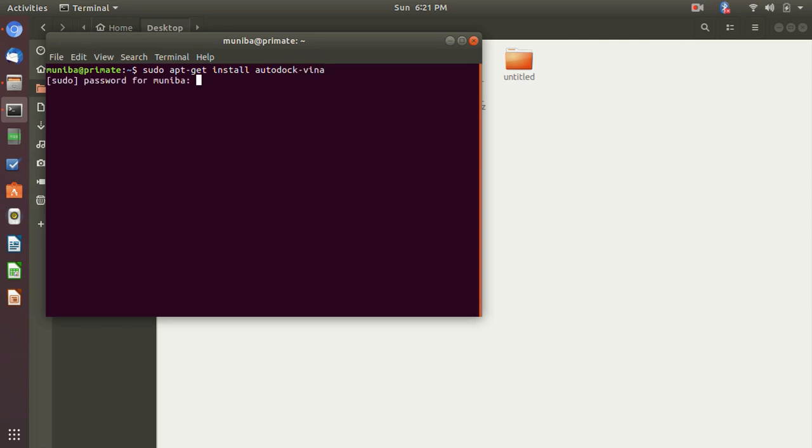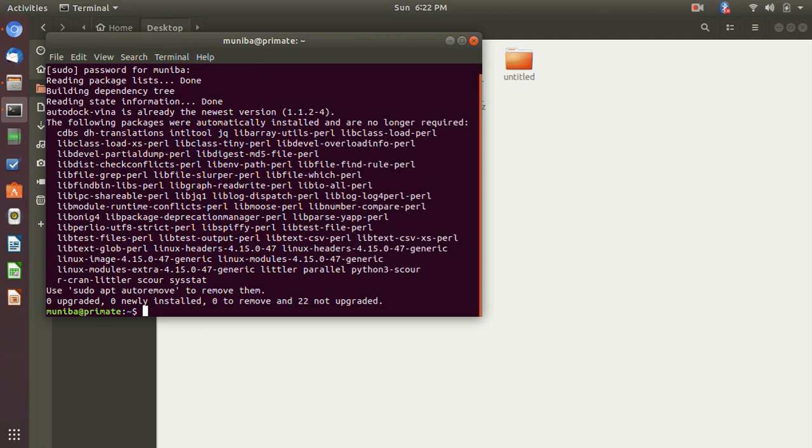It will prompt for your password. So I have already installed it, so it is showing that this is already newest version. So it's the easiest way.